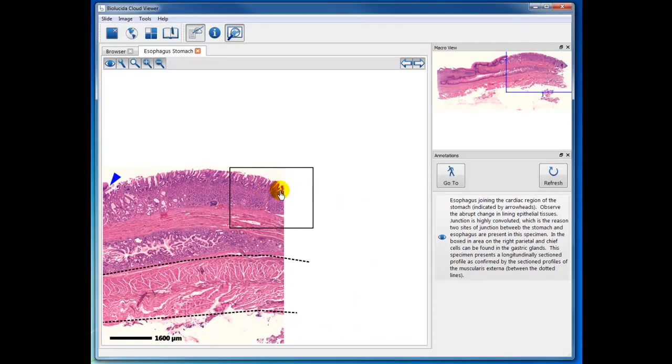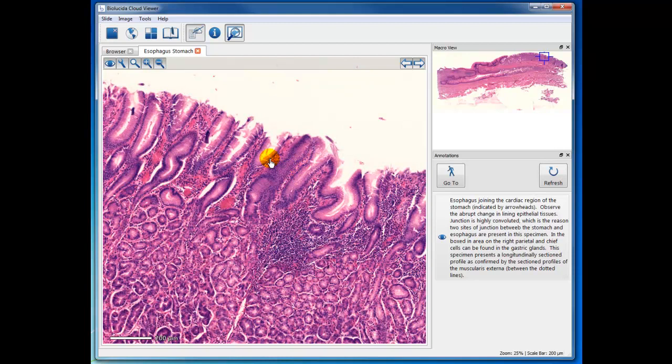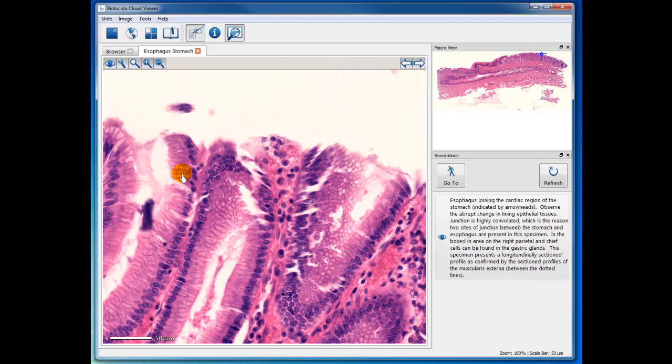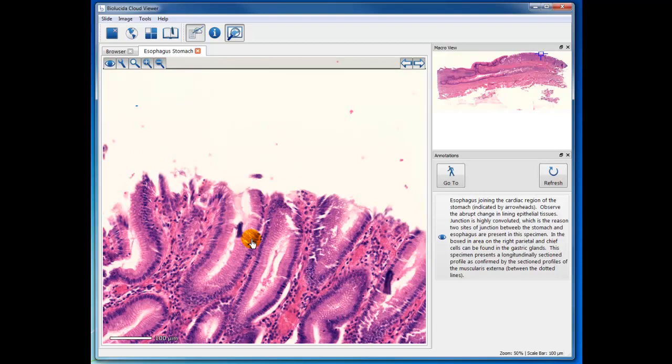this area that we recommend you study, for the most part the epithelial cells are intact, maybe right at the surface. In some cases here they go along the edge. Now notice all these cells are producing mucus, but yet they are not the typical goblet shaped cells, so we don't call these goblet cells. These are just mucus, simple columnar cells secreting mucus into the lumen of the stomach.